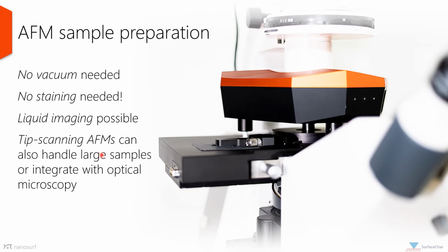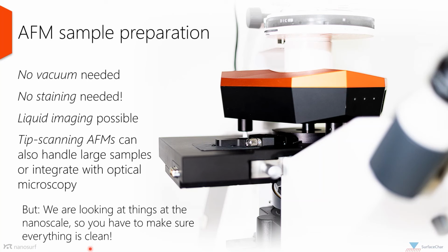And we can integrate tip scanning AFMs easily into optical microscopes, which allows us to do simultaneous optical and AFM investigation on such samples. And last but not least, we should not forget, we're looking at things at the nanoscale. So, albeit there's not a lot that we have to do, one thing that we have to take care of is that everything is clean.